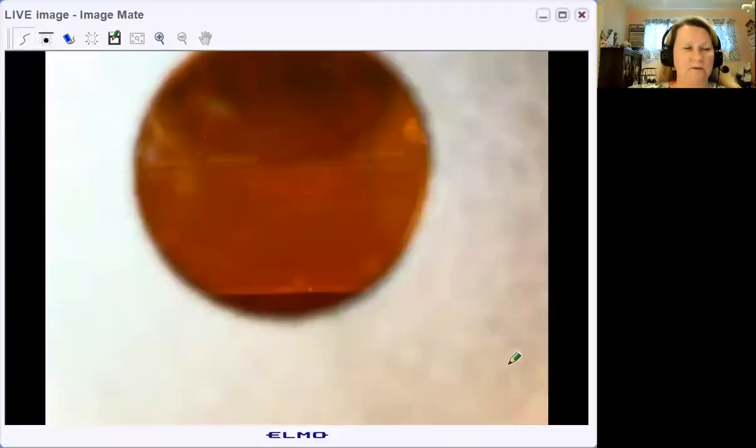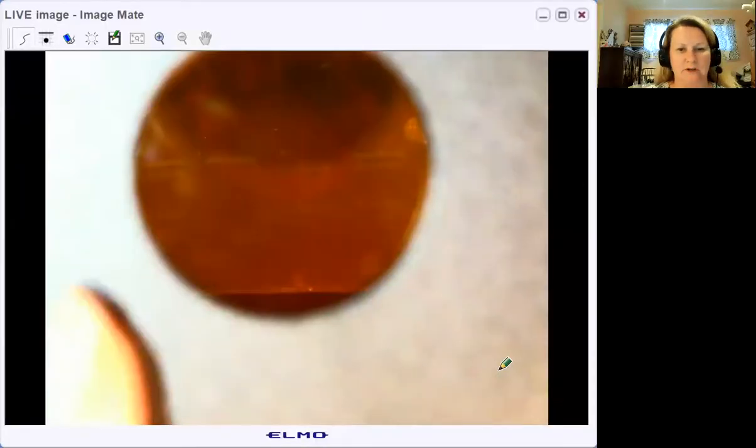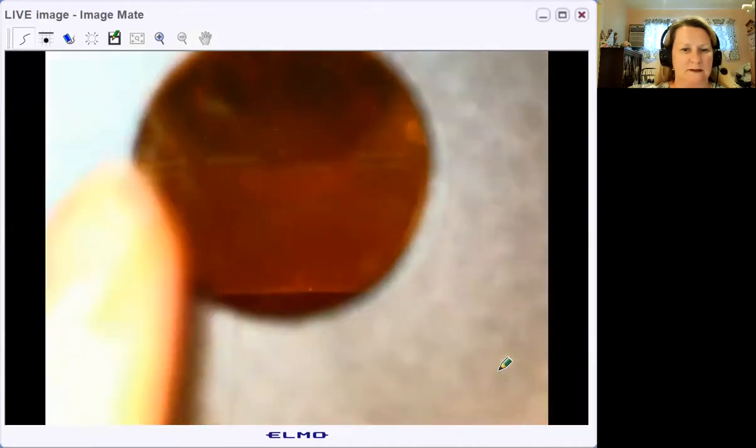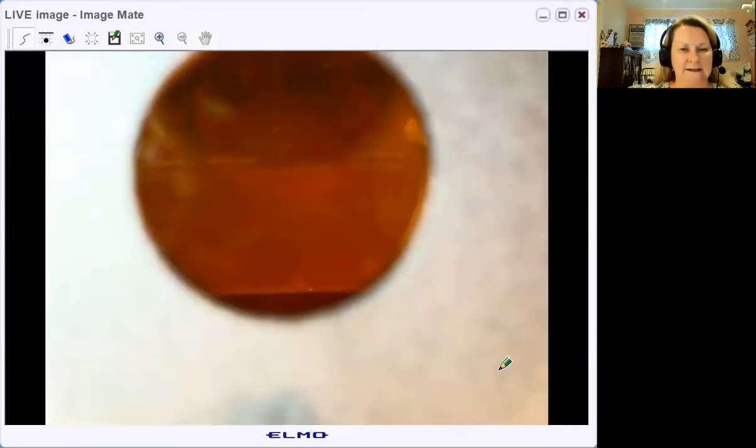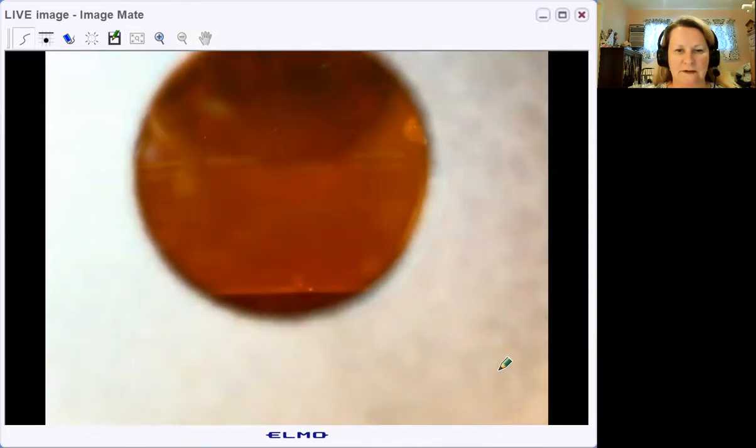Hi everyone, so it's been just 15 minutes since we started the gel and already it's time for us to look at our results. I want to show you a couple different things here. I've zoomed in the document camera right over the gel box there.